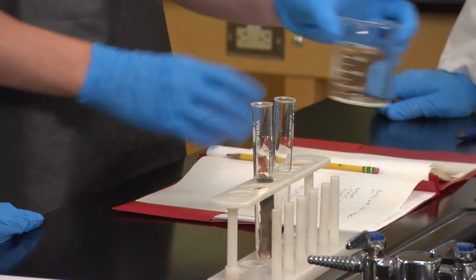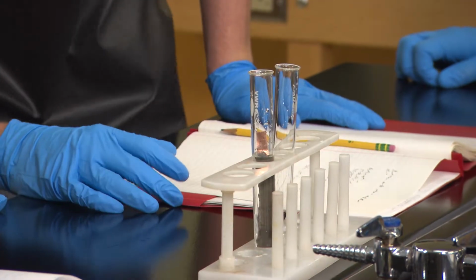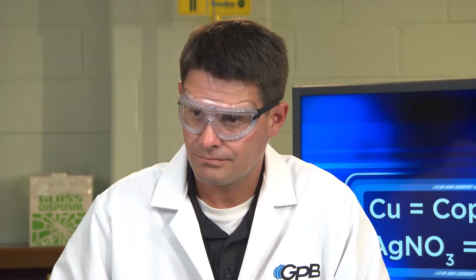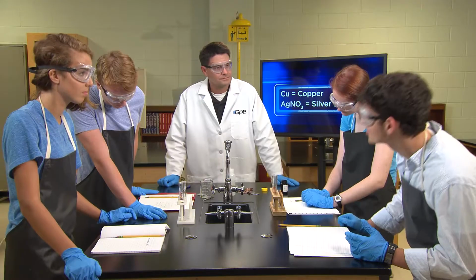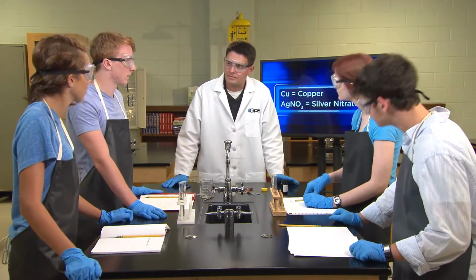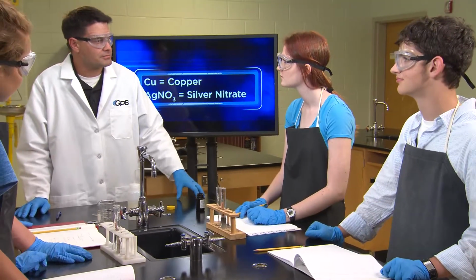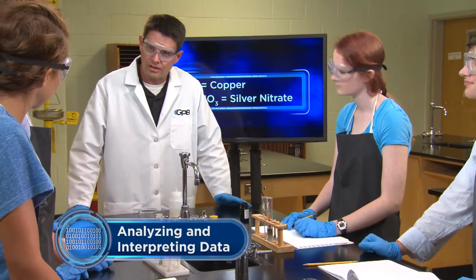What's happening in there? The copper looks sort of fuzzy. Now the water's getting bluish. I see crystals growing on the copper. Obviously, there's a chemical reaction happening, but what's forming? Well, think about what you mix together. Copper and silver nitrate. So based on your observations, what's most likely forming on the copper?